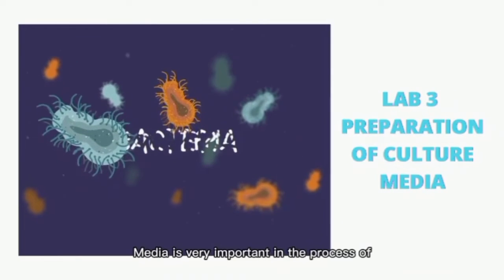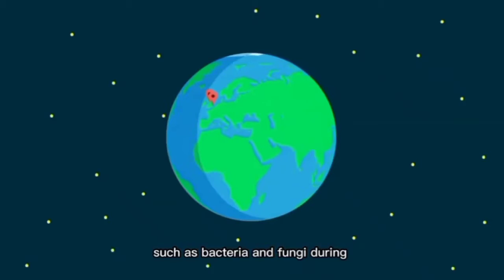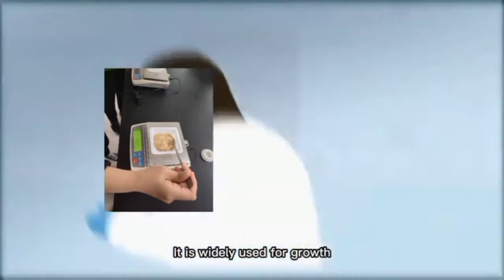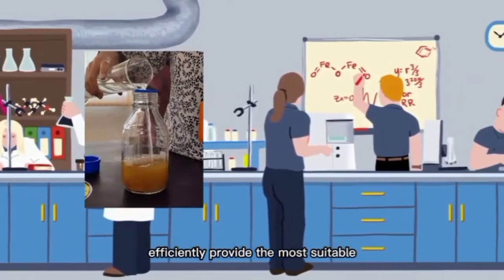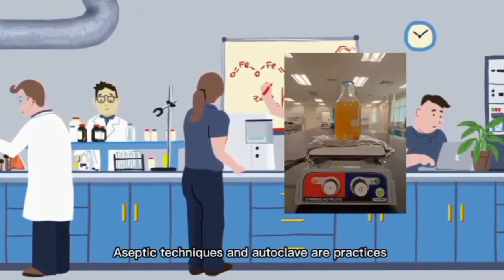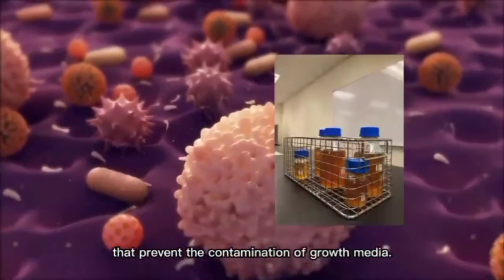Media is very important in the process of studying microbiological organisms such as bacteria and fungi during their time inside the lab. It is widely used for growth, separation, and purification. This is due to the fact that it can efficiently provide the most suitable conditions for the microscopic organisms. Aseptic techniques and autoclave are practiced to prevent the contamination of growth media.